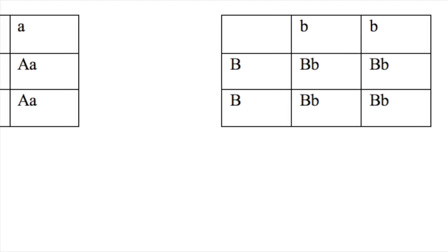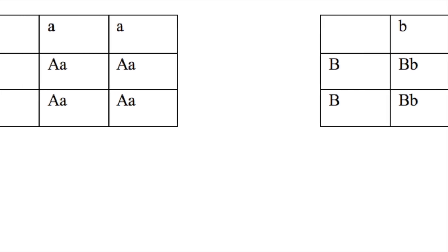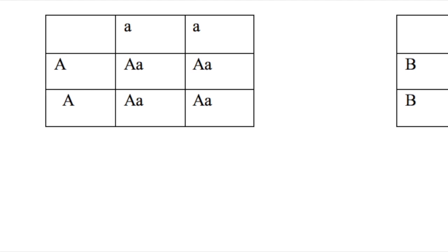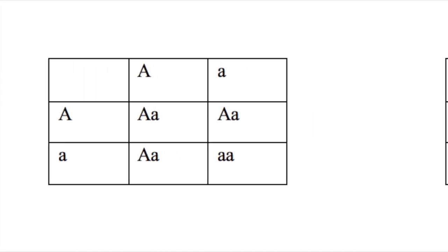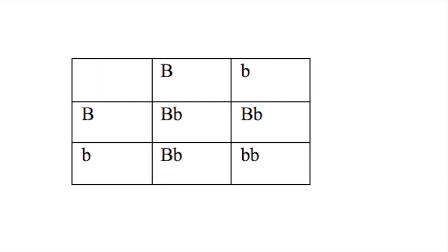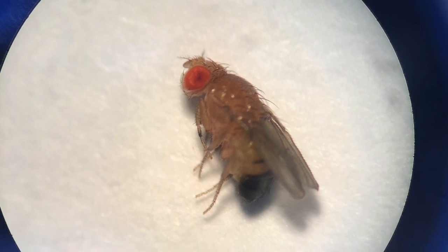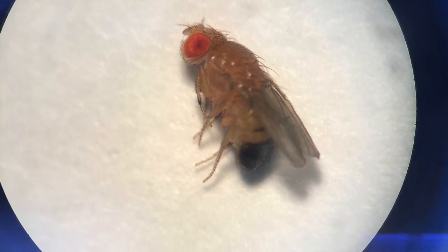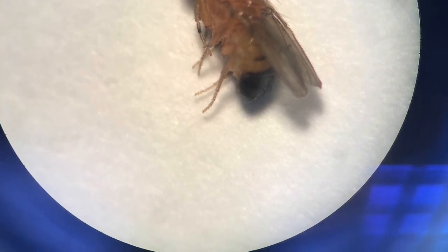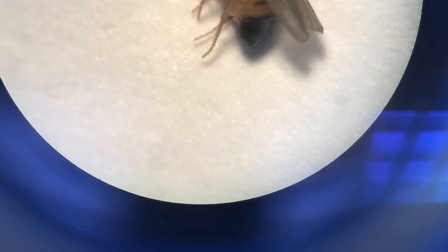The F1 Punnett squares were true to the real-world results. 100% of the progeny were red eye with wings. The F2 progeny were also close to the Punnett square results. About 57% of the F2 progeny should have been red eye with wings. The real-world results were 108 out of 161 flies, producing 67% red eye with winged flies.